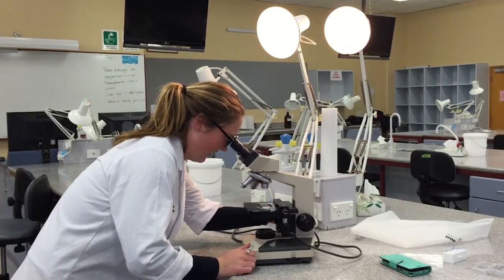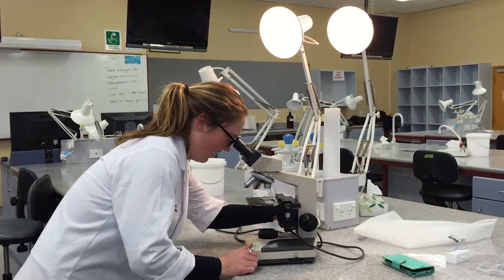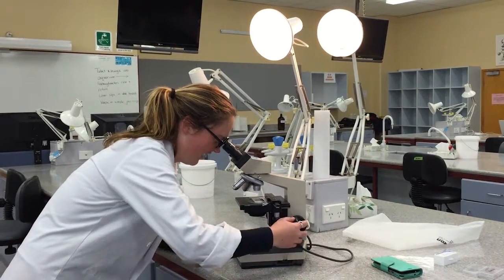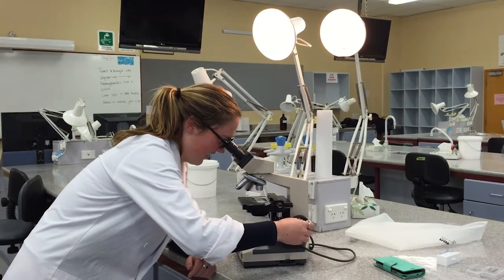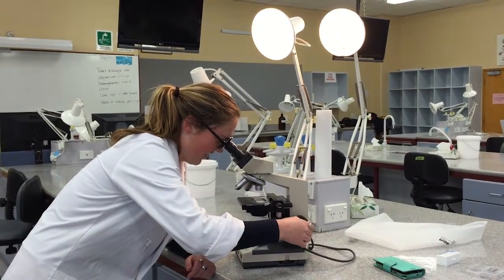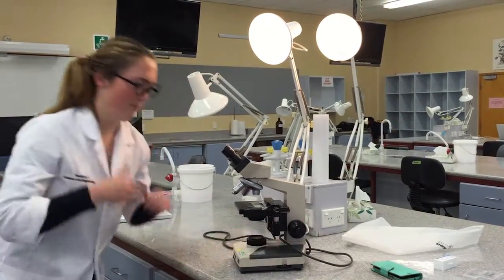The 10x objective is now selected and the fine focus knob turned to achieve higher definition. Following this, the 40x objective is also focused with the fine knob. At any time, use the voltage regulator or iris diaphragm to optimise light definition and viewing experience.